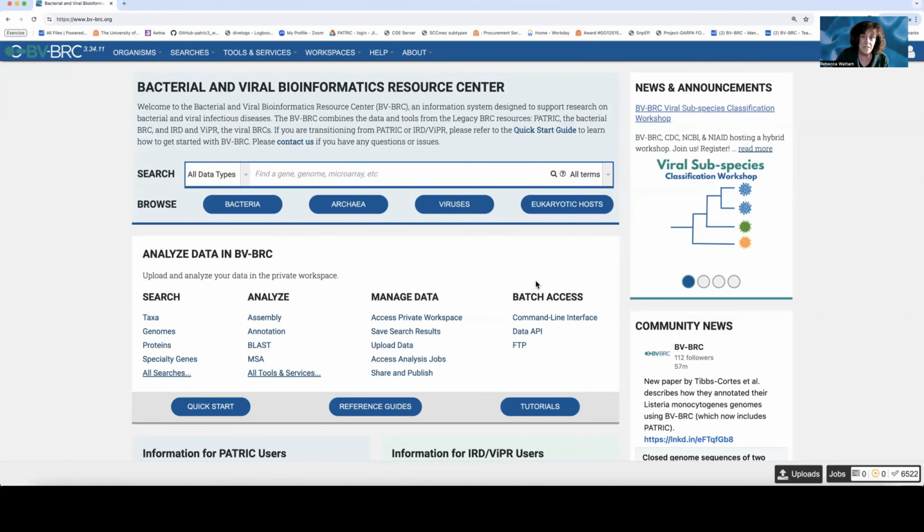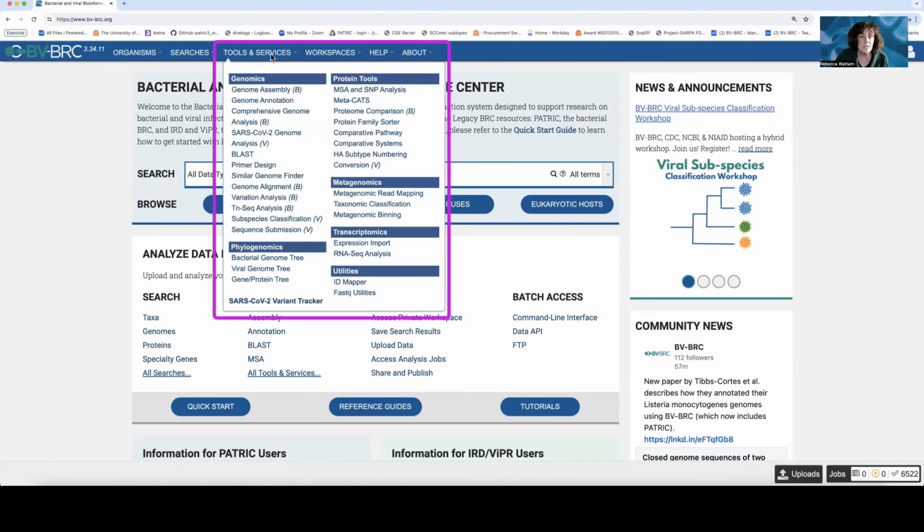In the last video, we uploaded reads to the workspace. So now let's try submitting the job. Let's go into Tools and Services, and under Metagenomics, click on Taxonomic Classification.